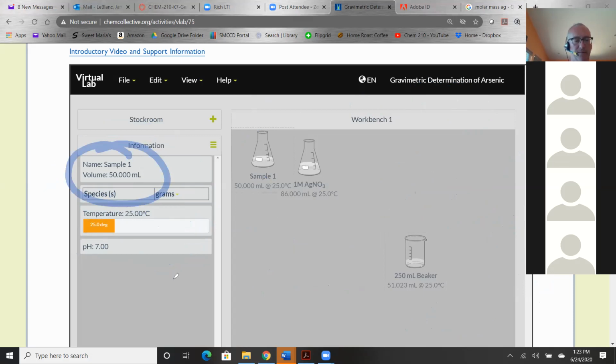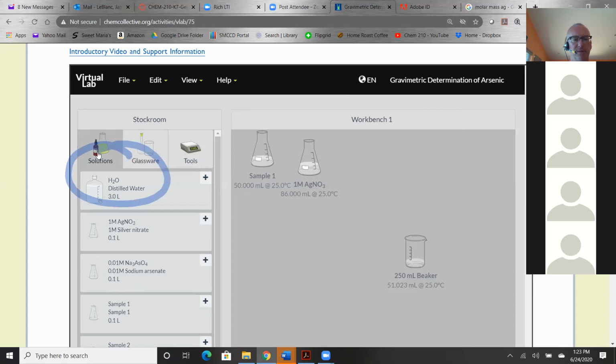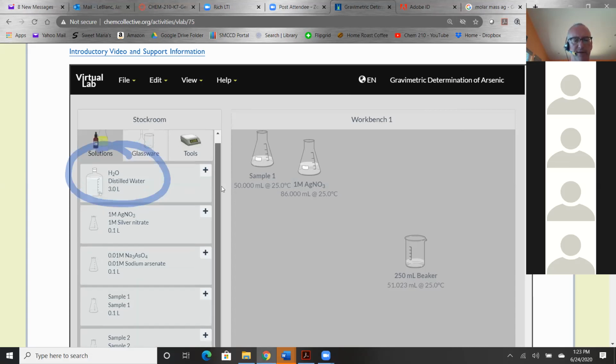Now if I click, in my icon, I do not have 50.000 ml. How can I change it? I have just sample 1, 0.1. That's a different sample. So go back to solutions and scroll down to sample 1. Yeah, my sample 1 is just 0. Yeah, this is okay. It shouldn't have any concentration on it because it's unknown.